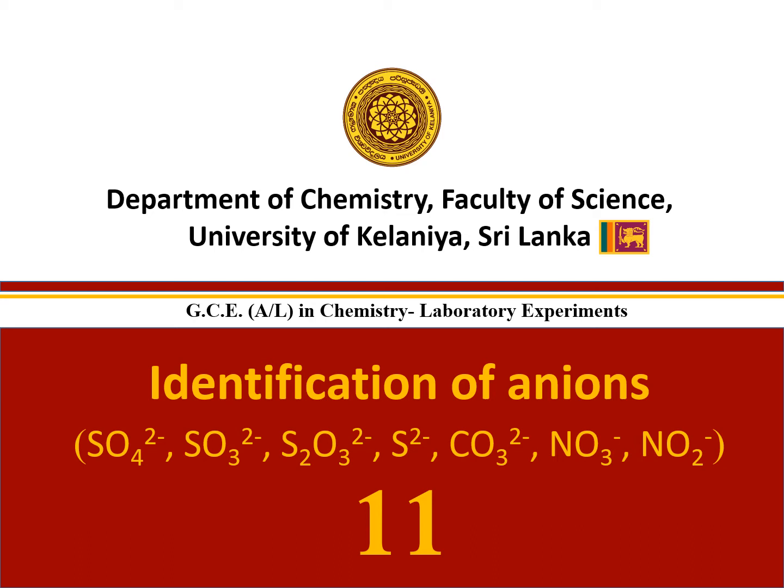Experiment number 11. Identification of anions. Sulfate, sulfide, thiosulfate, sulfite, carbonate, nitrate, and nitrite ions will be identified in this experiment.